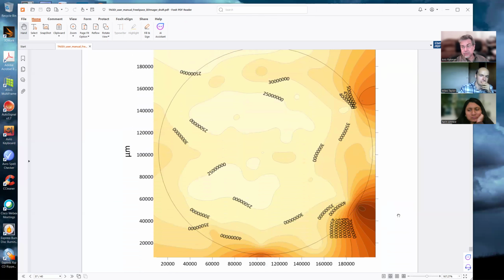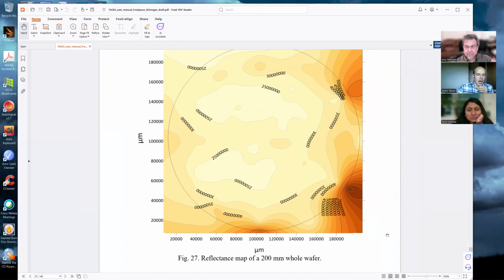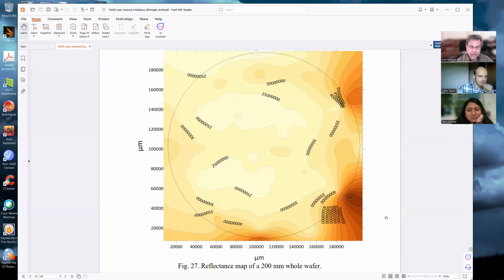You can do both. What I have not shown here is that the process starts from the surface of the wafer. So surface characterization, surface conductivity or resistivity, is called the sheet resistance, meaning resistance per square. It's important.